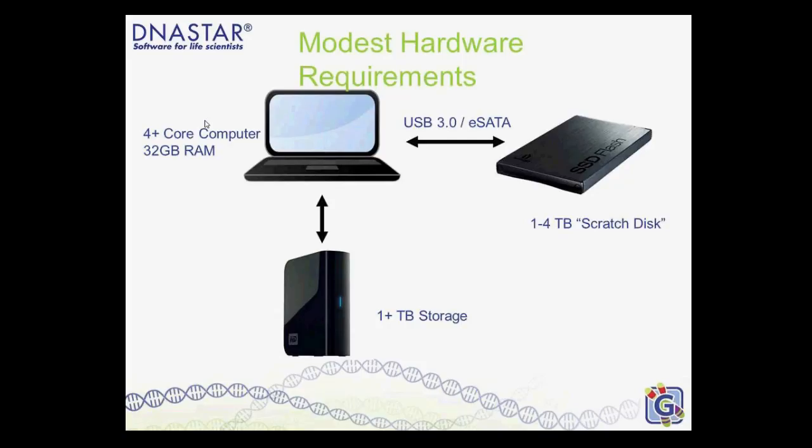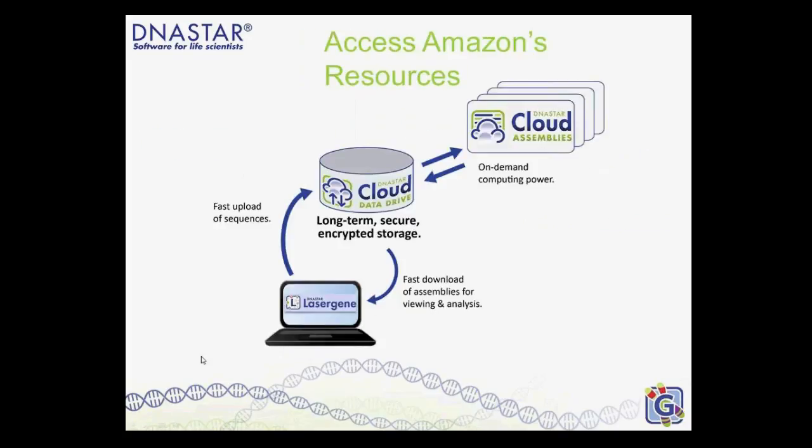When you're trying the software out, don't have your C drive do everything; use a scratch disk for temp files and storage. The typical C drive doesn't have the input-output that it needs to handle that much data. And if you have specific hardware questions, certainly contact me and I can help you there.